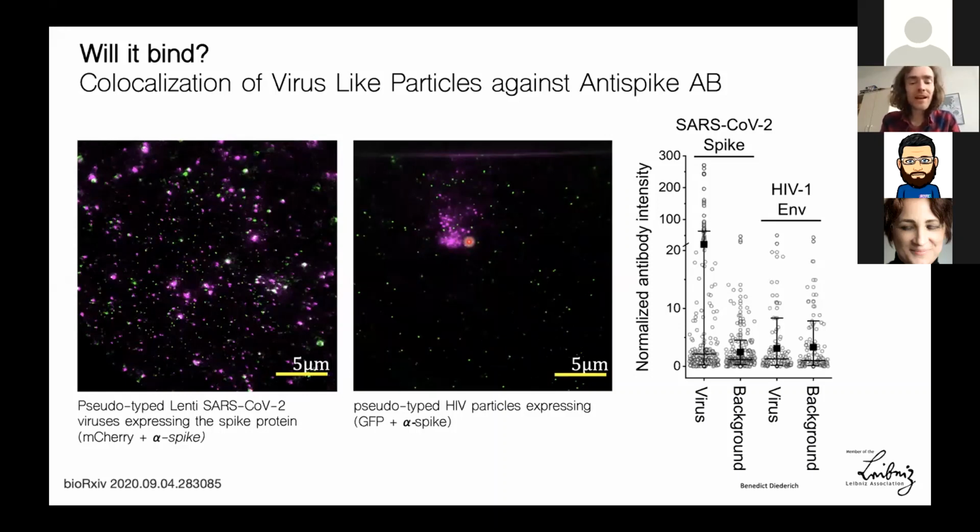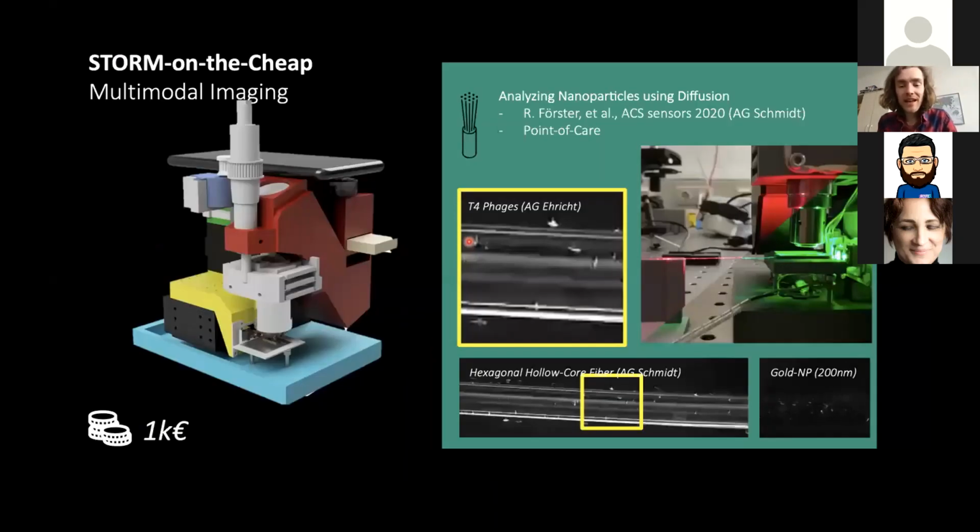Coming to the end more or less, I think this one I may skip, maybe just emphasizing the idea that you have this optical pickup device. It's not only useful for a chip, because you may ask yourself, where do I get this chip from? Well, there's a good message: you can buy it very soon, but you can also use the setup for example with fibers.